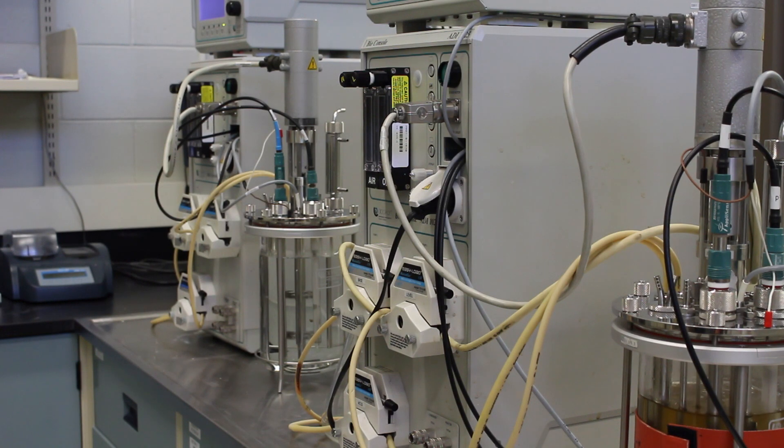Another important machine in the lab is the bioreactor. It is a three-component system consisting of a vessel, a bioconsole, and a control panel.